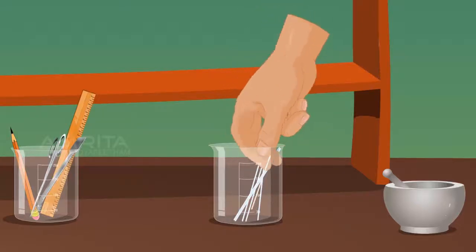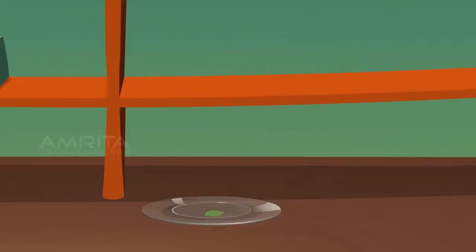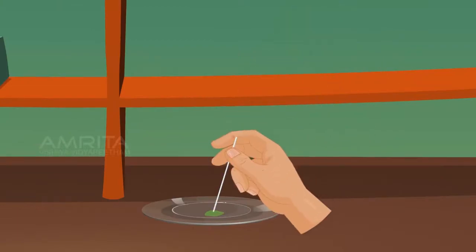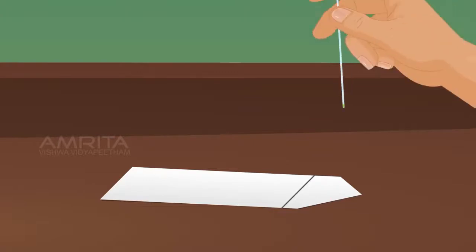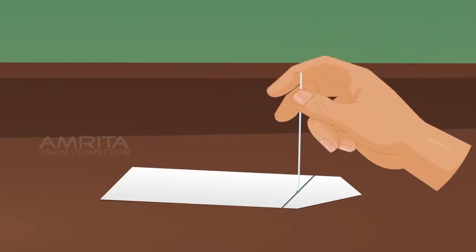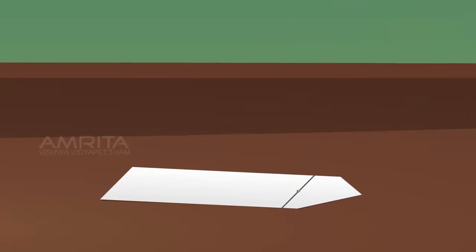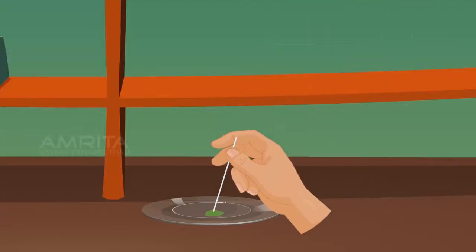Using a capillary tube, take some extract and put a drop of the pigment extract in the middle of the line. Allow the drop to dry and repeat this process until 4 or 5 drops are placed on the paper.